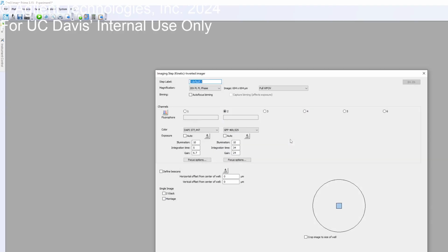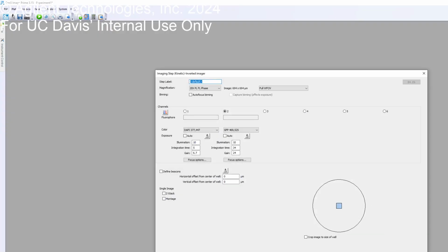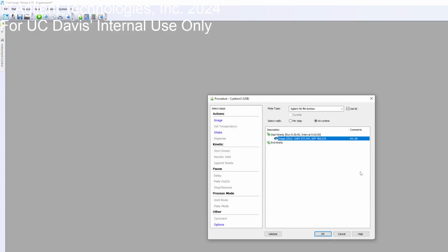So will it just do it as fast as possible, basically? Yeah, it's going to do it as fast as possible, and if it's not able to accomplish that in 2 minutes, let's say, it's going to try to match the number of cycles. We define 15, 16 cycles because it runs time point 0, and then time point 2, 4, and so on up to 30.